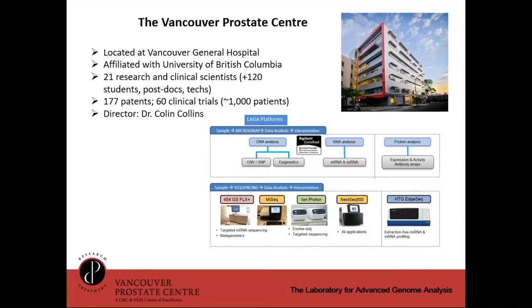So again, there's a little snapshot of some of the platforms we have in-house. I think this is actually a little bit outdated here, but it gives you an idea of the range of things that we do at Vancouver Prostate Center.